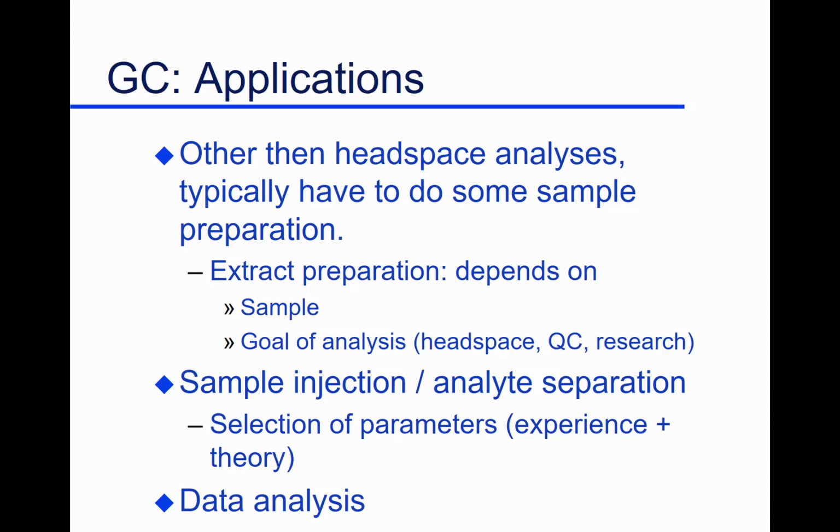One approach is, like I say, headspace sampling. Myson works with Pam, of course, and works in the area of flavors. He's looking at a headspace, but he has to concentrate that headspace a little bit before he can get enough material for the gas chromatograph.